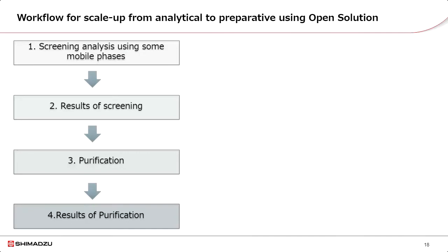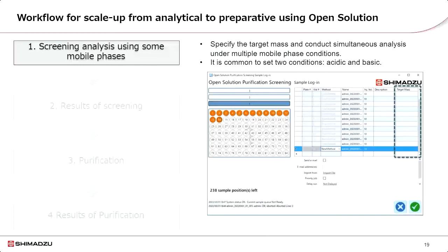Now, allow me to explain how this workflow is executed in OpenSolution from the operator's perspective, outlining the sequence of operations. First, we begin with the screening analysis conditions. As mentioned earlier, operators can execute this process simply by performing the following operations on a single screen.